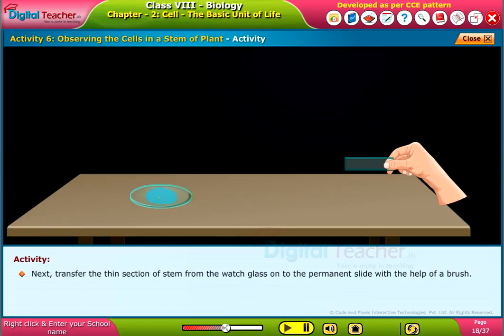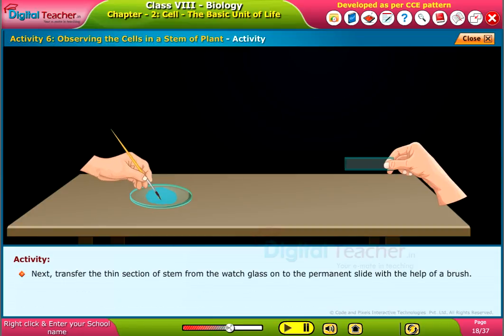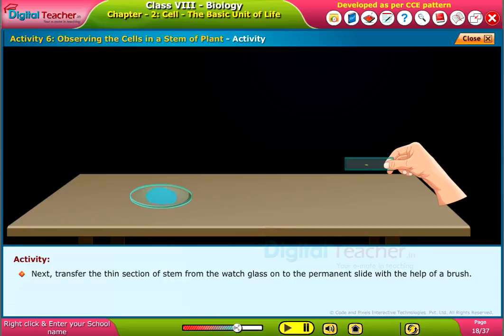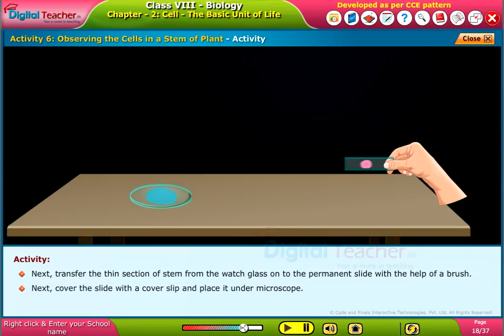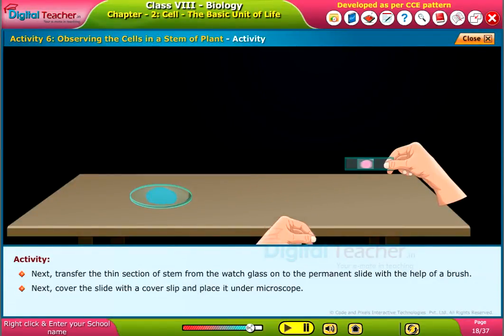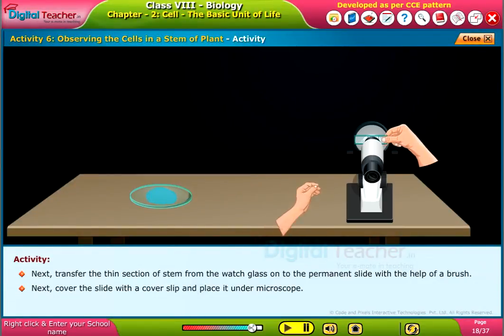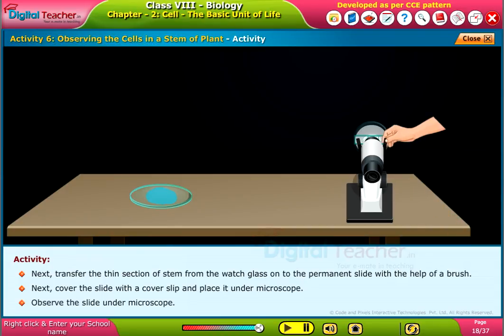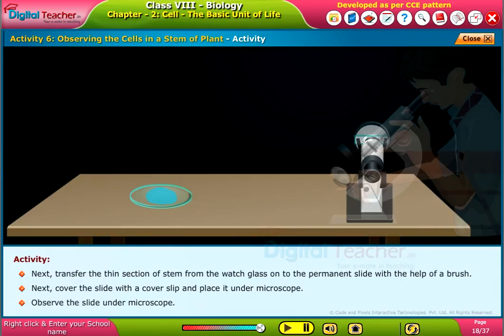Next, transfer the thin section of stem from the watch glass onto the permanent slide with the help of a brush. Next, cover this slide with a cover slip and place it under the microscope. Observe this slide under the microscope.